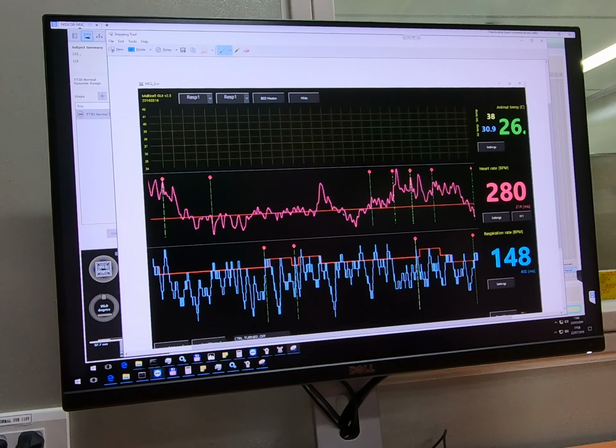So the curve is of course this kind of purple or pink thing, but we also see here, for example, this red line. The red line is the threshold, because we want to use the triggers, which are the peaks above the threshold. Okay, and the triggers are labeled with these green lines with, I don't know, pink dots on them.